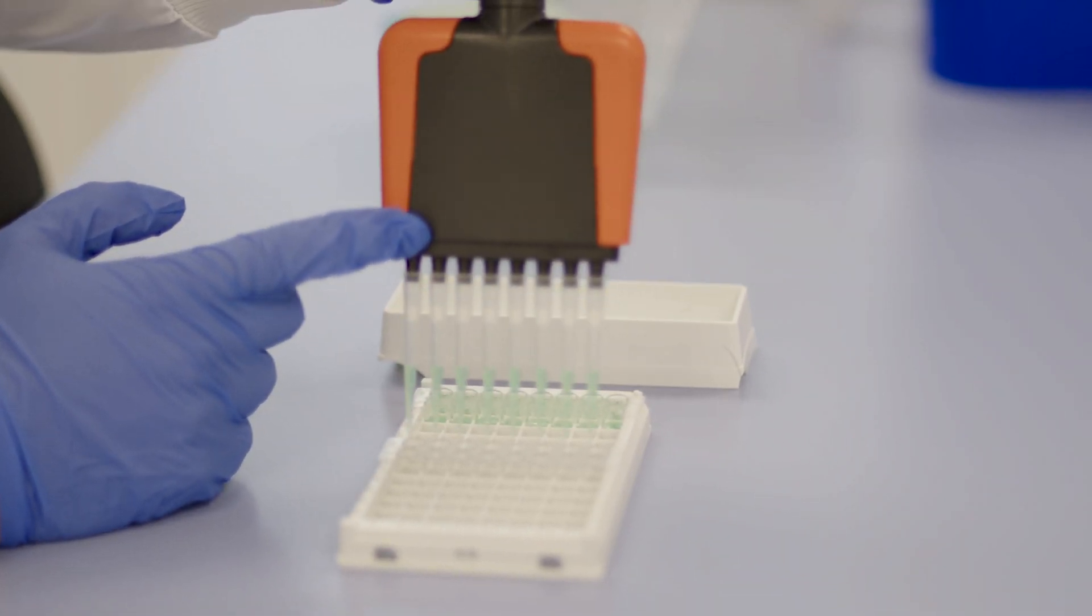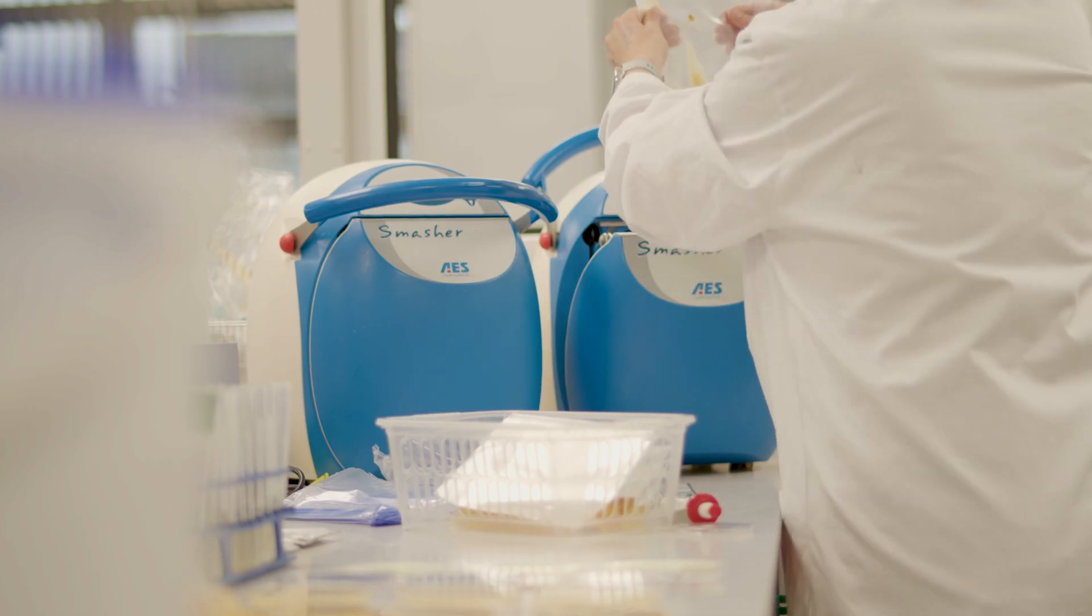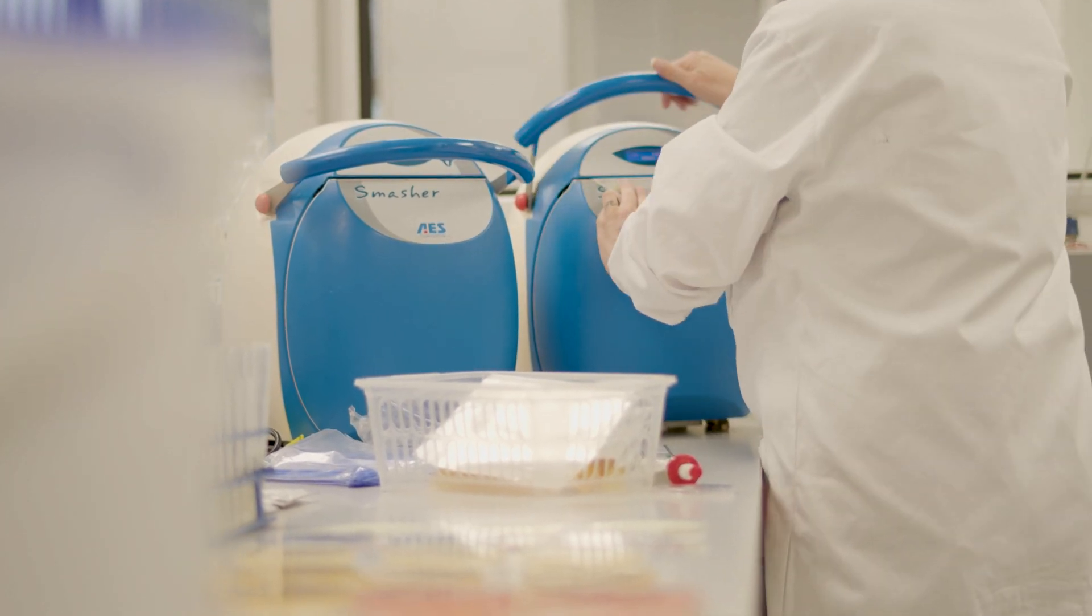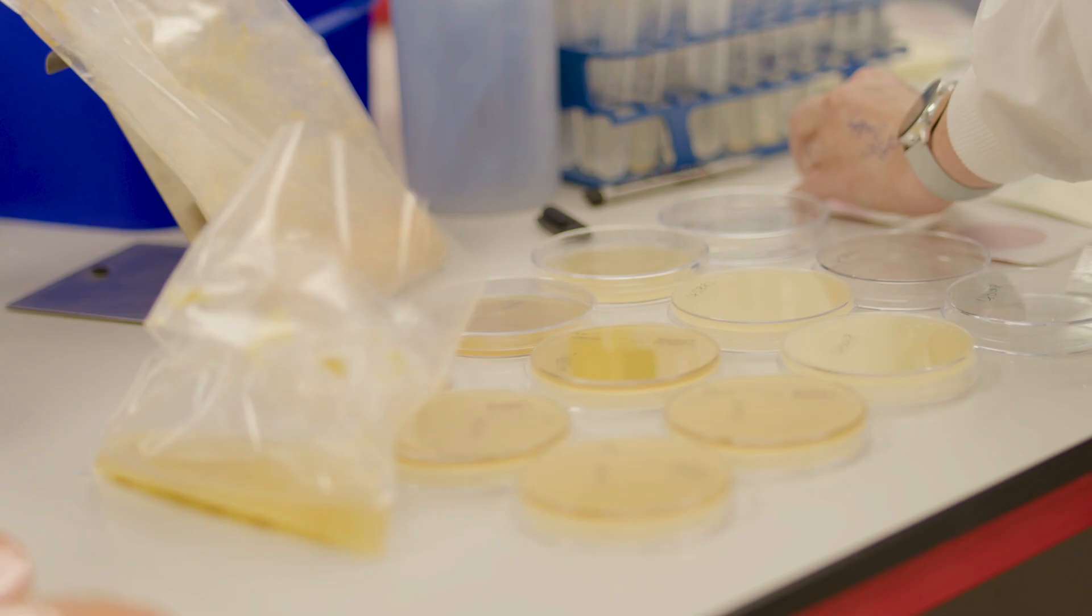The third area in the lab is our chemistry lab, where we do nutritional testing to validate the information on the labels of our products, for example fat or protein content.